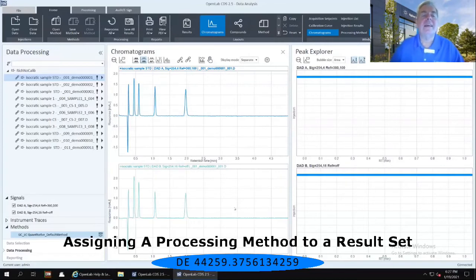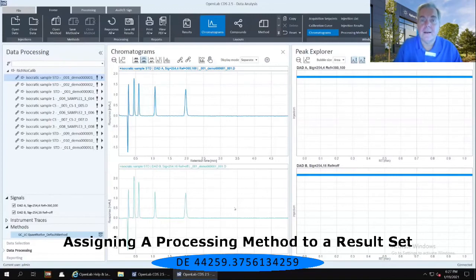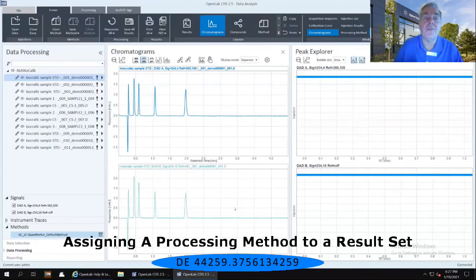This is the truest form of raw data. I've got chromatograms that have been created, but I have absolutely no data analysis that has been done on those chromatograms at all.